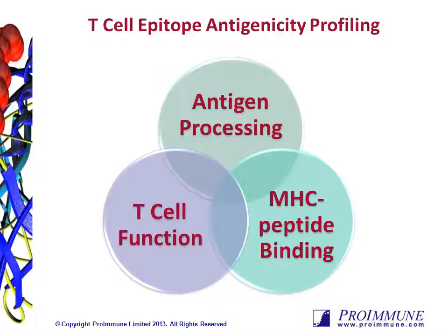The peptides have to actually bind to MHC molecules in order for them to be ultimately presented. This will be limited by the MHC restriction of the MHC molecules present on the cell. And three is T cell function. In order to respond, functional T cells recognizing presented MHC peptide complexes have to be available. This is based on whether a T cell receptor with sufficient affinity is available in the peripheral repertoire, and any response is further subject to mechanisms of peripheral tolerance and other drivers of effector function.